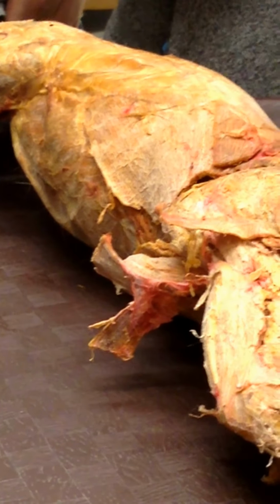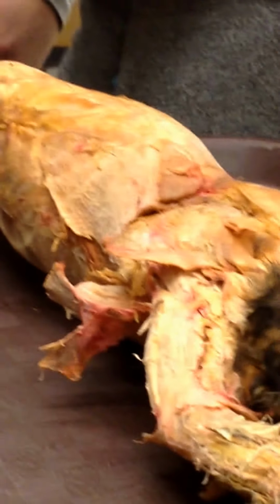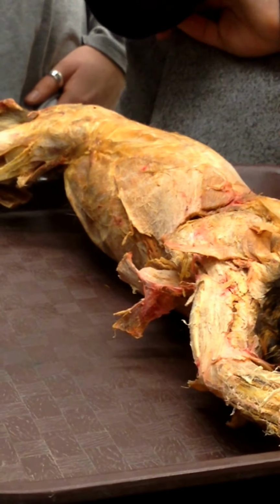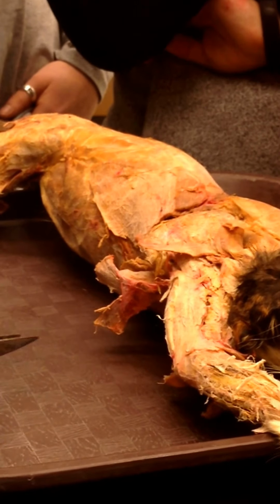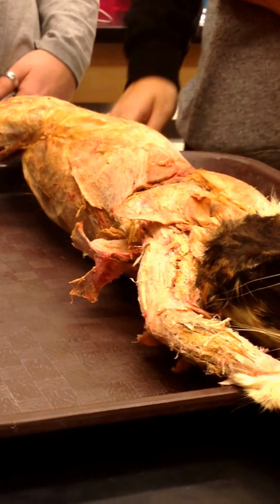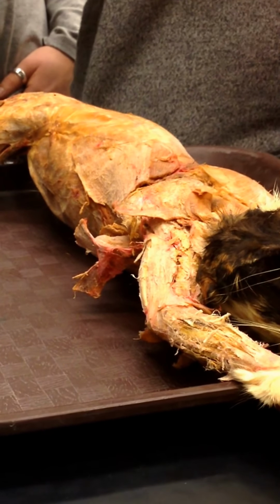Now this muscle that's hanging from the side is latissimus. It's one of the toughest muscles on the back and helps in trunk rotation. The way it's cut, half of it is cut so that it always hangs off the side. What does that do for the cat? It's trunk rotation, even the body movement, everything. So this is Latissimus Dorsi.